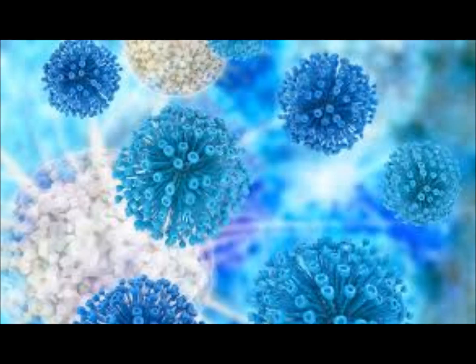But we're going to start with gram staining, but we'll wait till everybody does it together. And maybe when we get the plates, you can go ahead and make smears. I have a QC slide already. Just make a smear. Remember what plate you were, Amanda? Yesterday that you did a gram stain? You probably have the organism on you. Yeah, it's written. And then you can get that and make one.